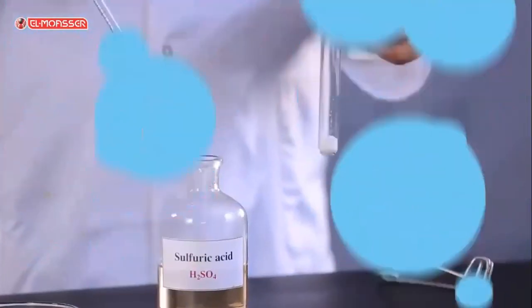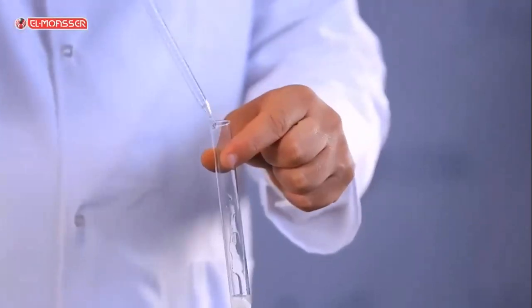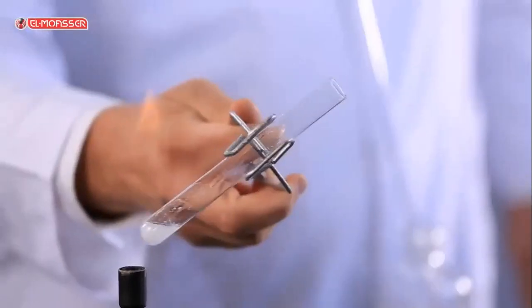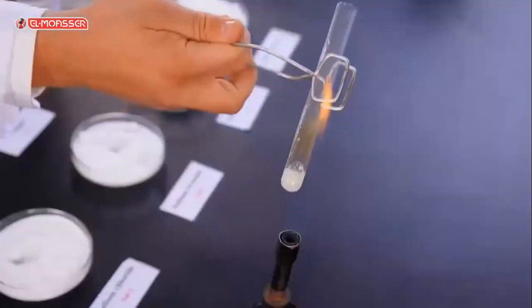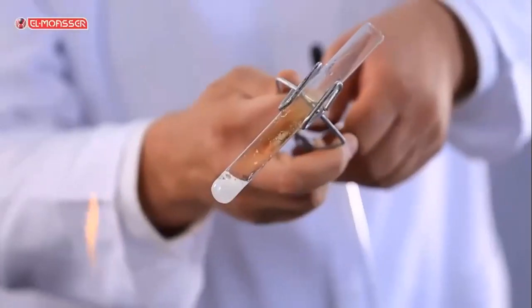Summary. On adding the concentrated sulfuric acid to sodium nitrate salt, on heating, brown vapors of nitrogen dioxide gas evolve, which increase by adding copper filings.